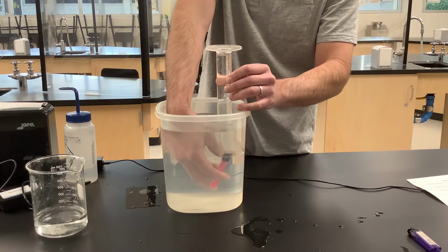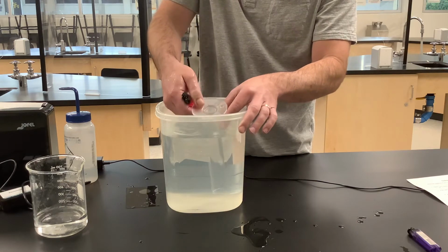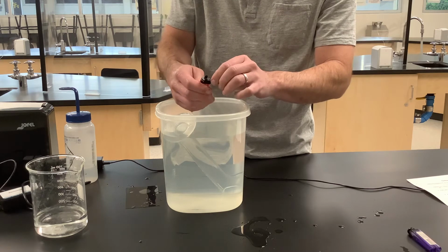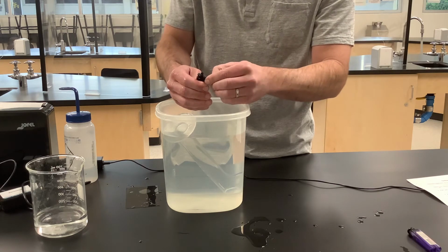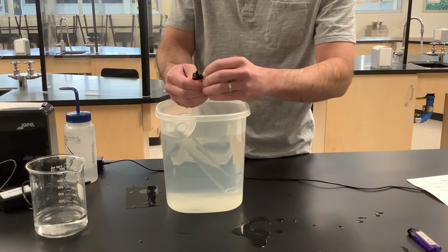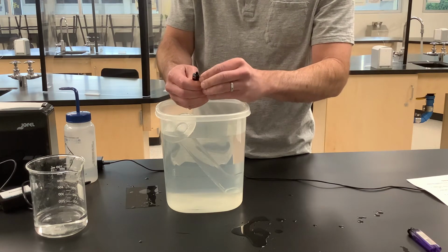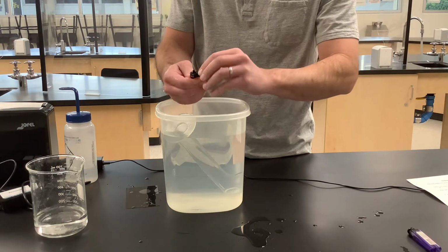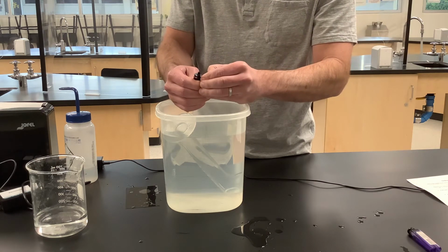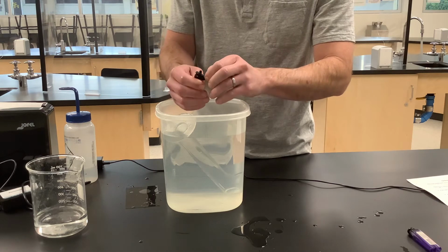Sometimes we can speed this up a little bit. Let me see if I can speed it up. Sometimes it works, sometimes it doesn't. You can adjust the lighters so that they get a bigger flame, which usually means more gas, but this seems to be kind of maxed out already. Let's see if I can get it to turn a little bit more just to speed up the process here.